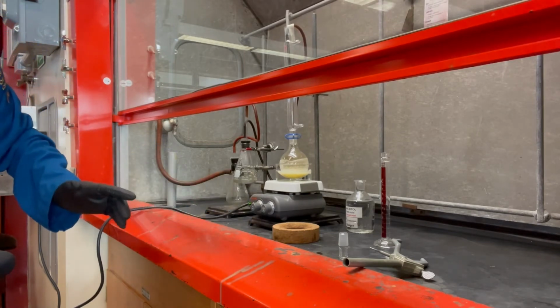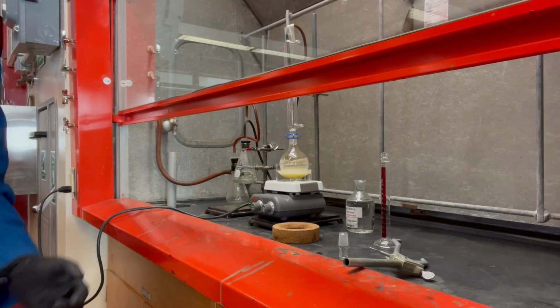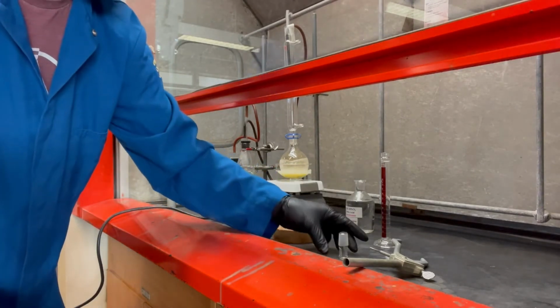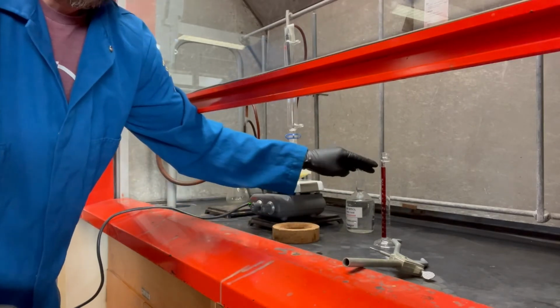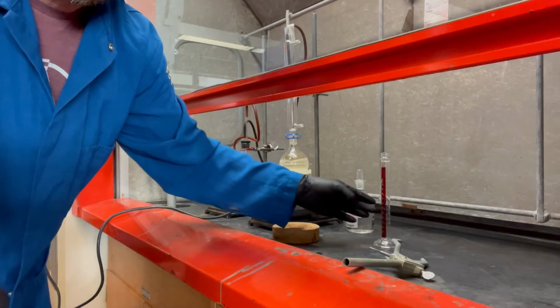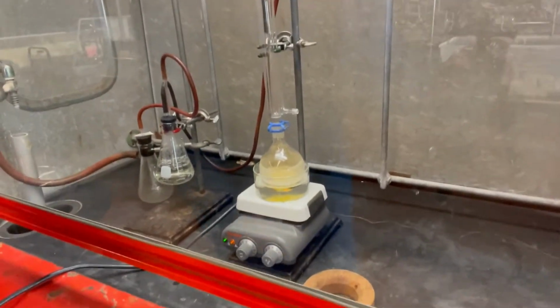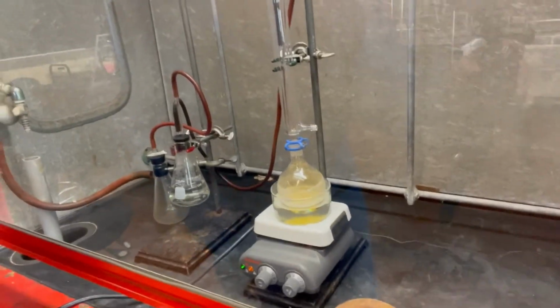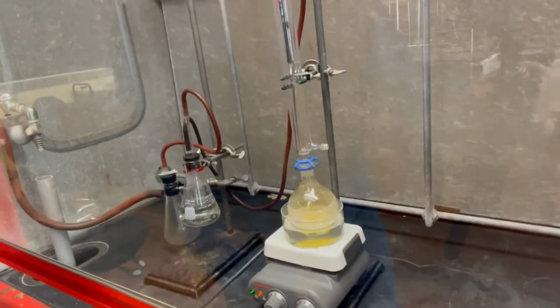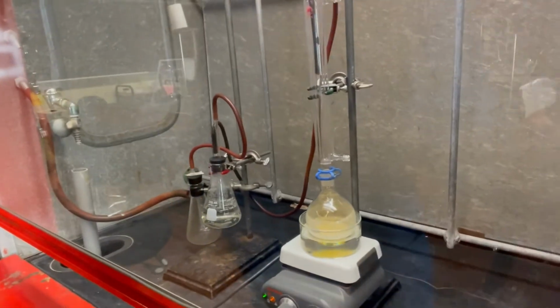Remember, we want to heat it to around 70 degrees. Yeah. All right. I'm gonna go change my gloves. Sitting in this lab, waiting on this flask. Gotta get the temperature. You better get there fast, because I can't start the timer until it reaches 70.